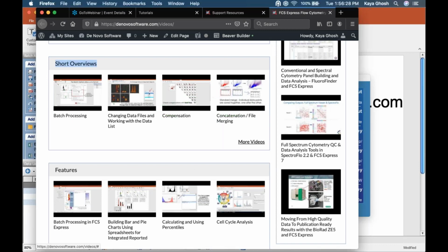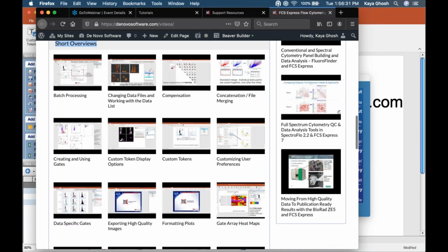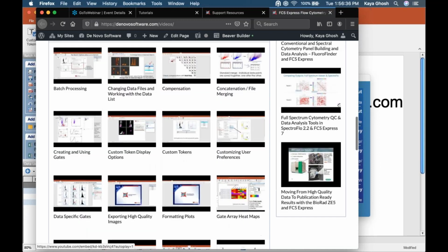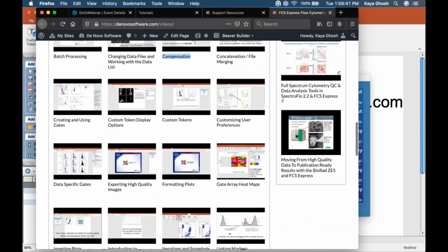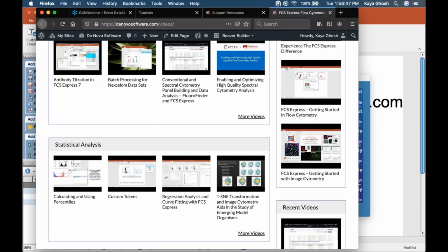If you click on more videos, for example, there will be 3-minute videos here on every possible topic. I think there's one on batch processing. Yep, that's the first one. Here's one on compensation that could get you started on that, because I didn't have time to cover that today. So it's a wide variety of topics. Please check that out when you have time.